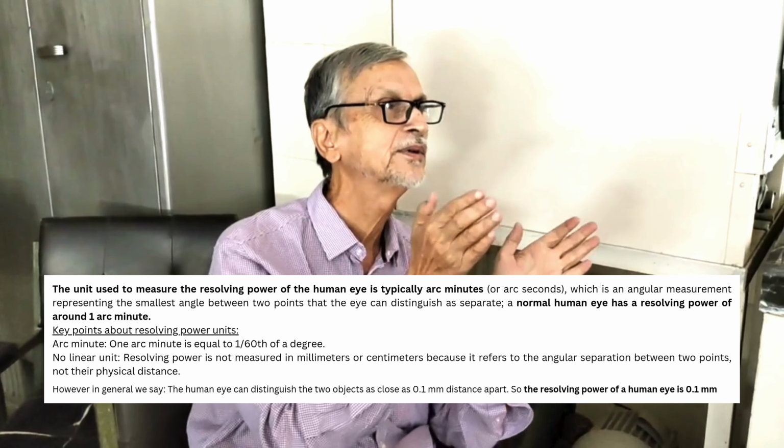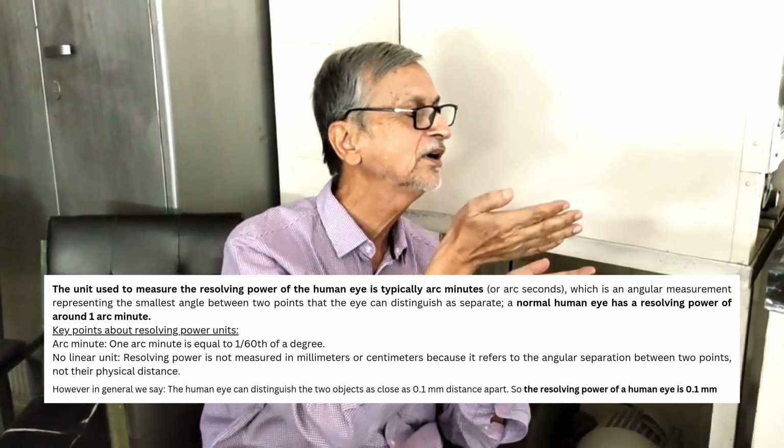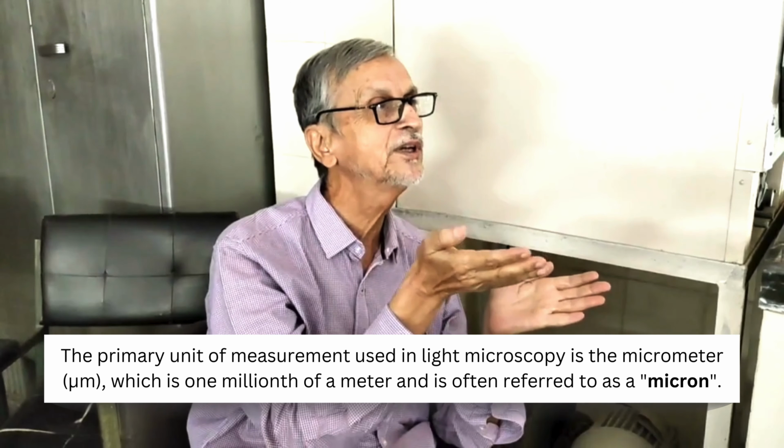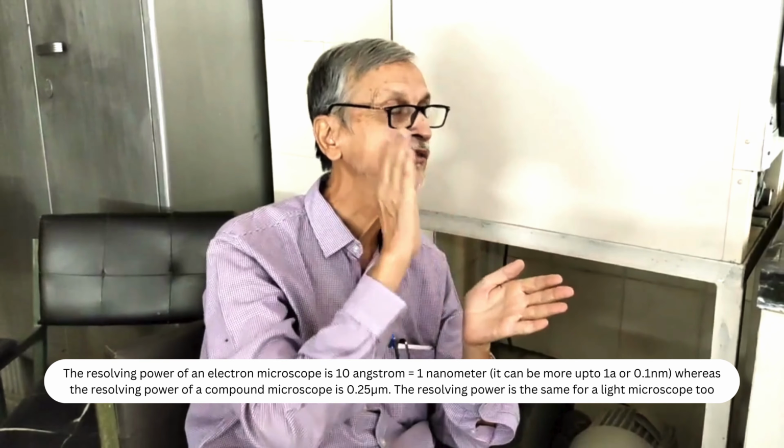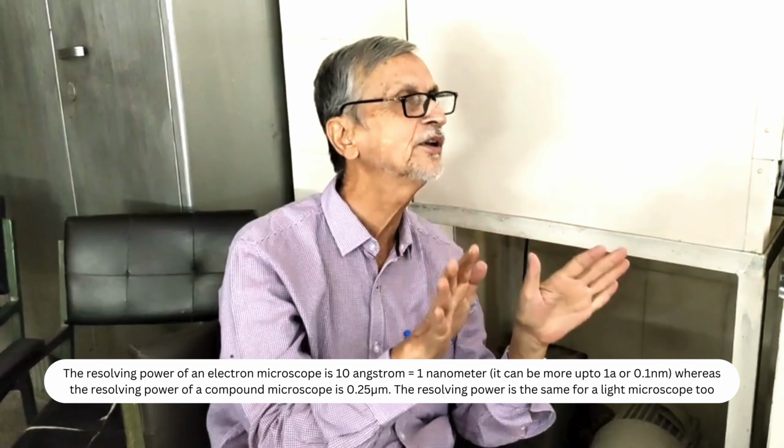The same thing is true here. For example, resolving power is 0.2 micrometer. Usually the scale we use for the eye is centimeter, meter. For a microscope we usually use micron. For electron microscopy it is nanometer, the standard. Angstrom was used earlier, but now it is nanometer. So the measures which come are in the range of 0 to 500 and 1000. It is not 1 lakh or 2 lakh. You got the point? That is actually the resolving power.